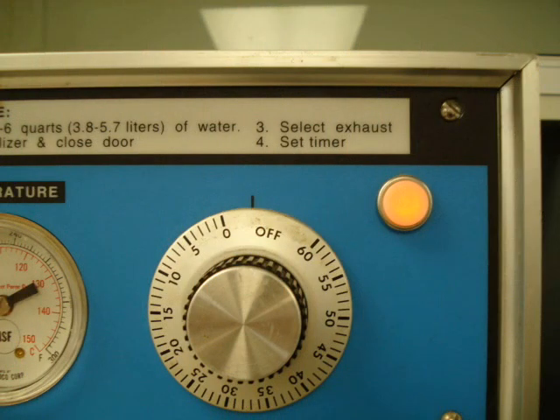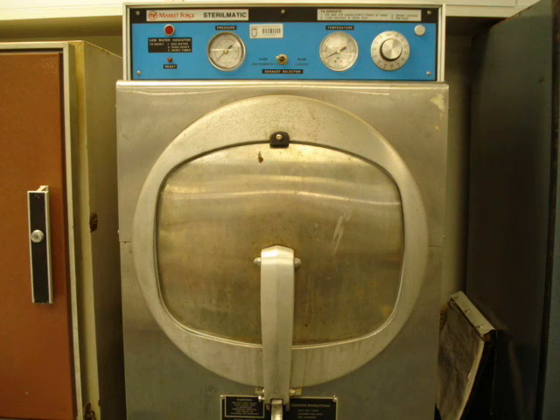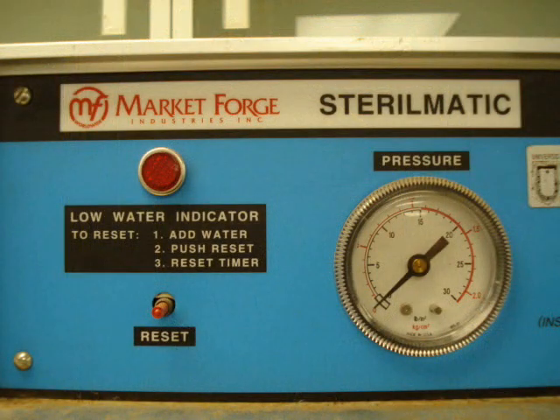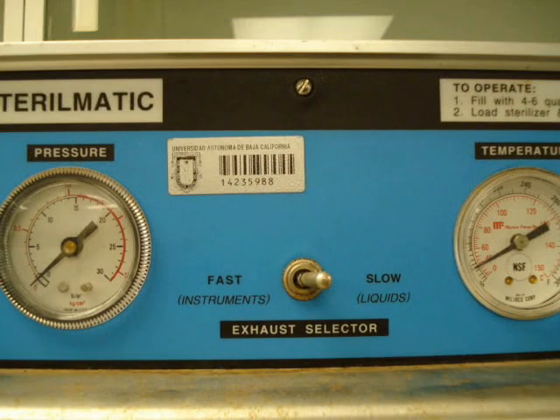Para encender el autoclave, basta con girar hacia tu derecha el temporizador, asegurándote de haber cerrado anteriormente el autoclave. El foco rojo indica que el autoclave está encendido. El tiempo que se le pone al temporizador es generalmente de 15 minutos, y empezará a correr cuando la temperatura y presión alcancen un mínimo de 121 grados centígrados y 15 libras sobre pulgada, respectivamente. Debes vigilar que los indicadores de temperatura y presión suban paralelamente hasta alcanzar ese valor mínimo. Si tienes cualquier duda, no temas en preguntar al laboratorista, profesor encargado o amigo con experiencia.